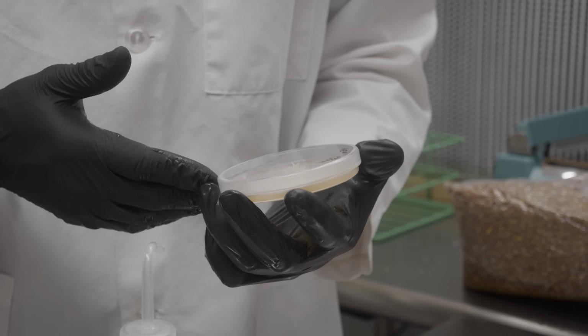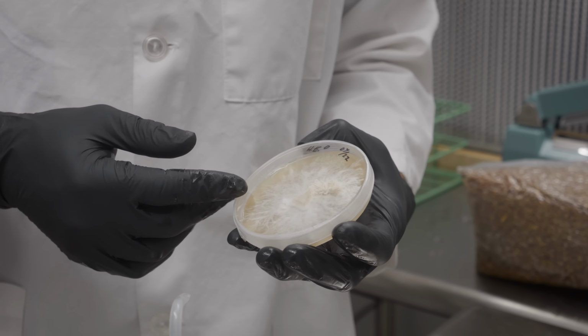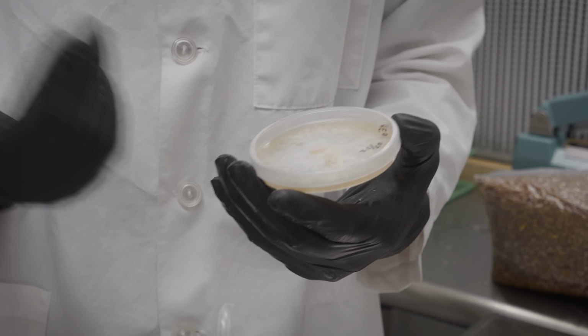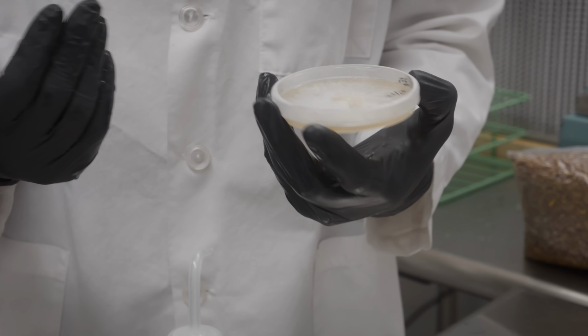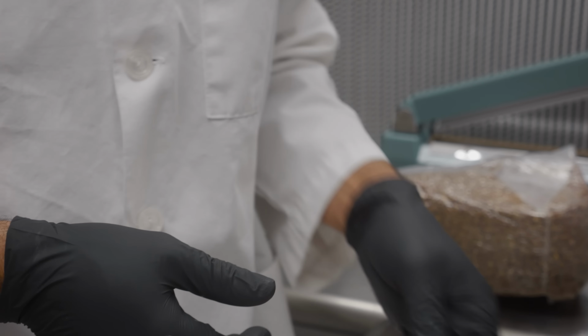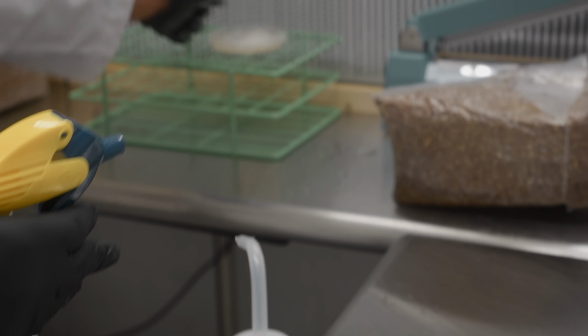We just have a multitude of varieties that we're going to be using. So this is the HE0. This is a nice lion's mane strain that has real long teeth. It closely resembles the bear's head, or Hericium americanum. It's a really great strain that I've loved growing for a while.